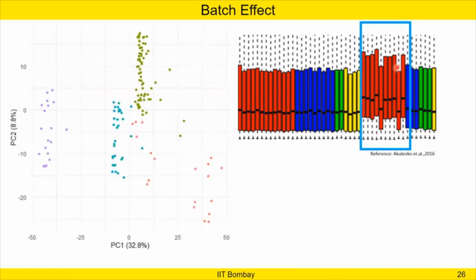So I want to show you some live example. In one of the projects, I was doing some meta-analysis where I took some data from the repository, and I tried to see, though these particular data sets are from the same diseases, the grades are also the same, but still you can see that the studies are so different from each other, right? And this is something which we call the problem of batch effect. Though these are meta-analysis studies where the studies have been run in different labs, on different instruments, still this is a big problem. And in this kind of data, normalizing the data or even batch correction doesn't work. So that is the thing I must say, that please look into your data, or whatever data you are downloading, to check whether your data is having any batch effect or not.